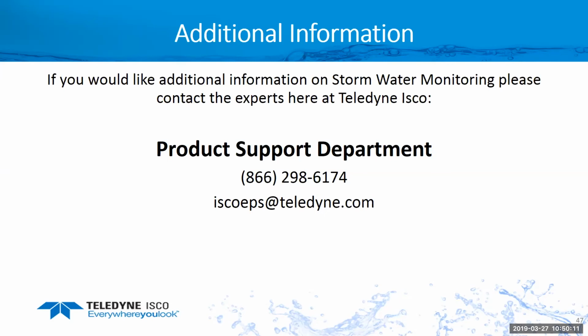The other thing is don't take your readings as fast. Instead of going every 5 minutes or 15 minutes, you may have to go at 30 minutes. In the long run, the power that's required to make that laser go is set in stone. In order for this thing to operate and give us the numbers we need, this is the power it needs to do these things.